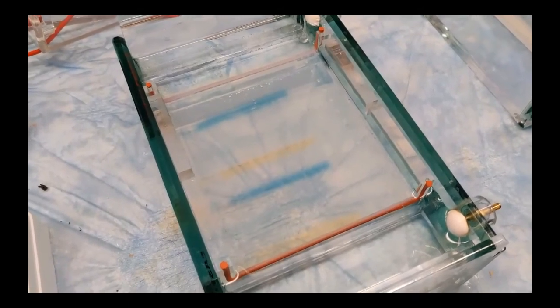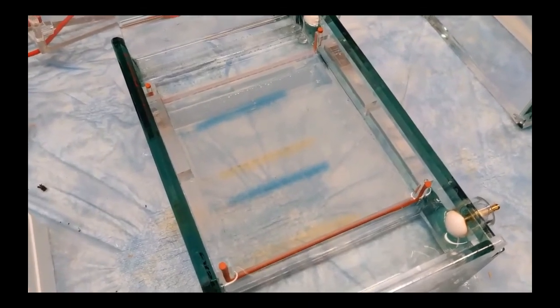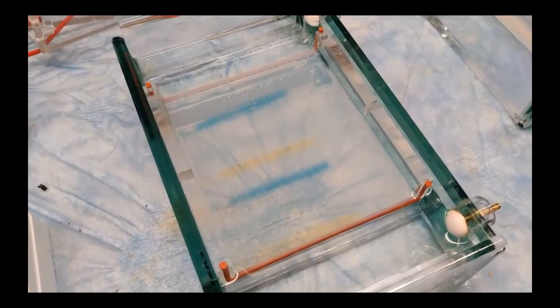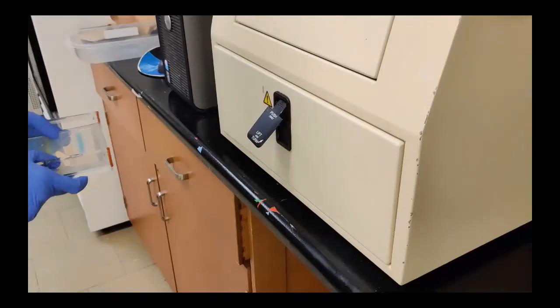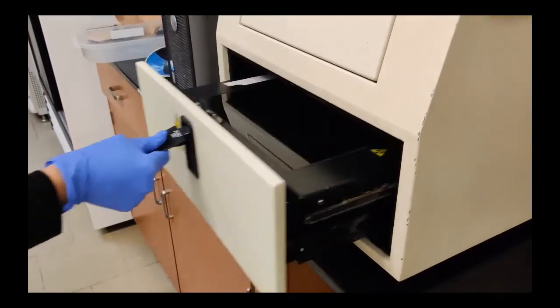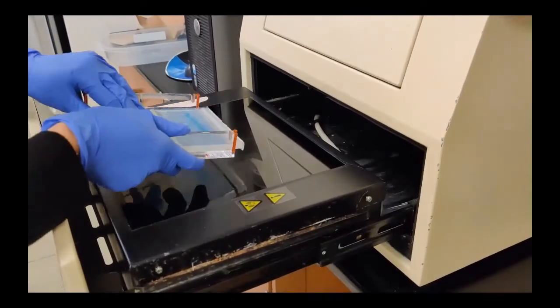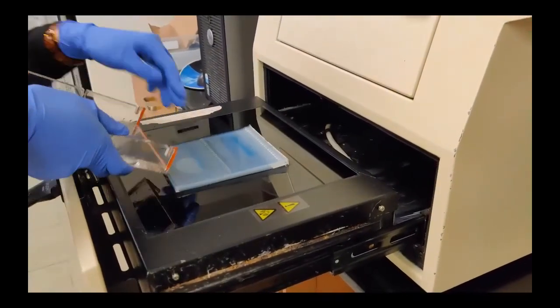We can run the gel for 45 minutes to one and a half hours. Here is the gel after finishing. To see the dye, we need to apply UV light. We will do this using this trans illuminator.